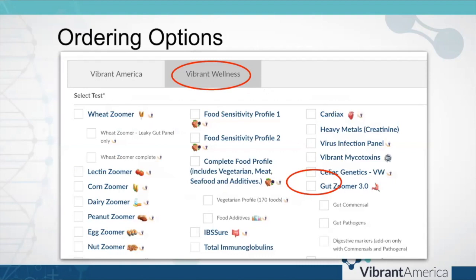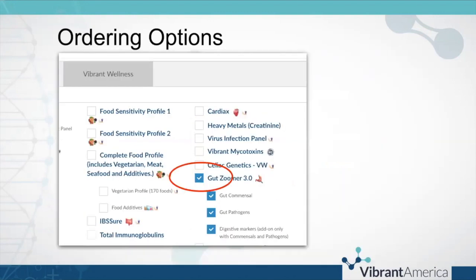To order the Vibrant GutZoomer, you're going to click on the Vibrant Wellness tab in the ordering portal, and then you'll notice over in the far right column GutZoomer 3.0. If you click on the first box right next to GutZoomer 3.0, it will automatically select to make sure it orders all of the components of the test. If you wanted to order only the commensals or only the pathogens, you can do that, and you can also add on the digestive markers. But then you're only getting a little bit of the information instead of the entire puzzle, so ordering the entire test has the most value for your patient.